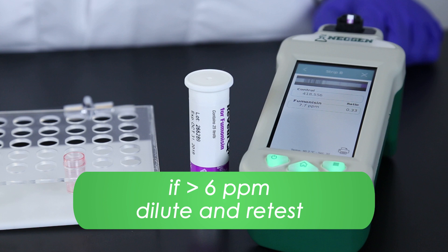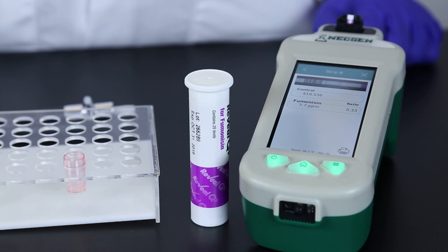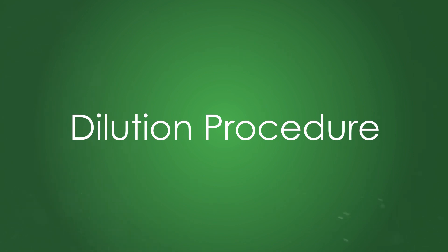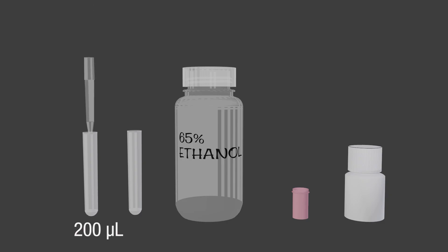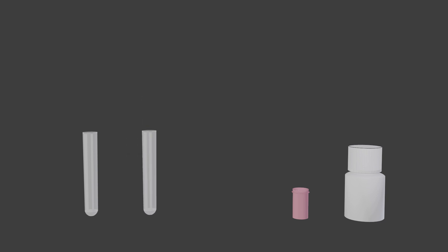For samples greater than 6 ppm, you will need to dilute and retest. Add 200 microliters of sample filtrate to a sample collection tube. Add 200 microliters of 65% ethanol and mix well. Transfer 200 microliters of the sample dilution to a red dilution cup. Add 400 microliters of sample diluent and mix well.